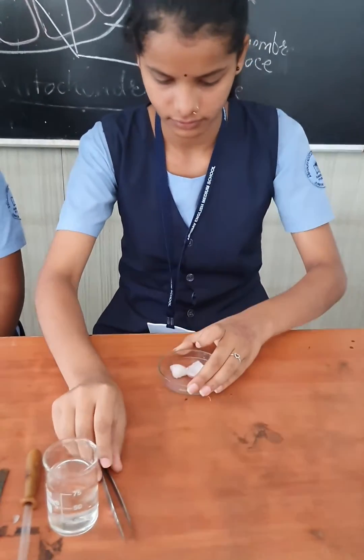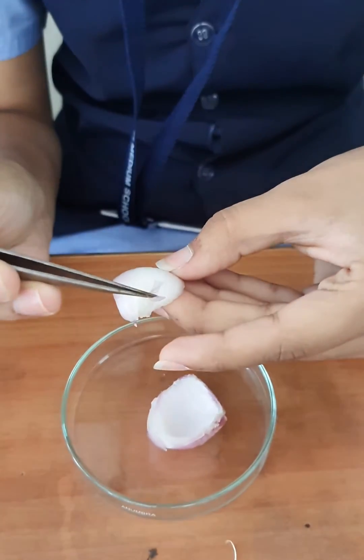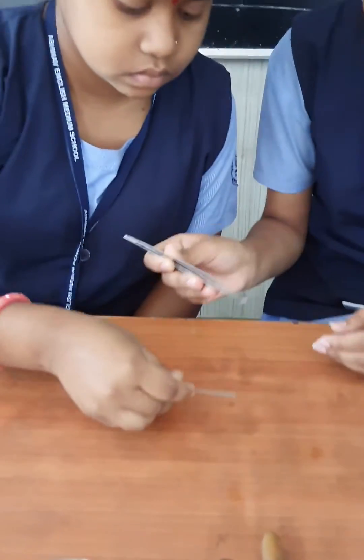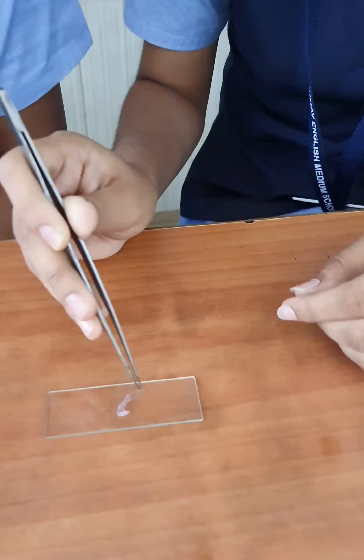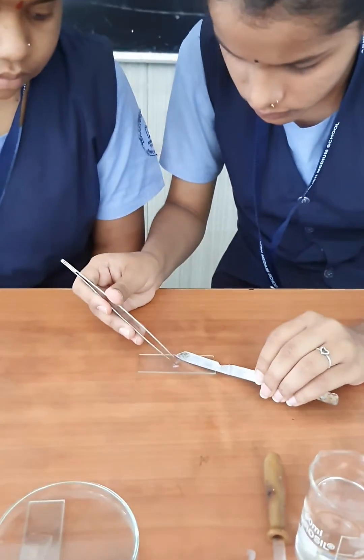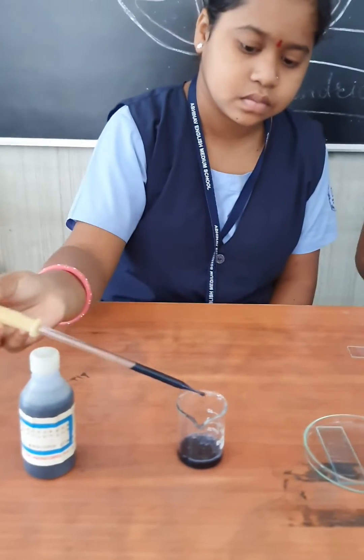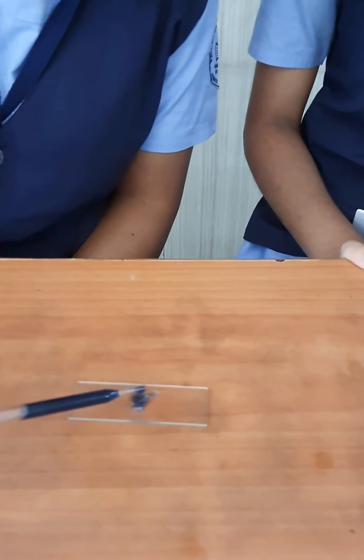First, tear a fresh leaf of onion and collect a piece of the peel. Spread this peel carefully on a slide. Now put a few drops of Janus green B stain on the peel and allow it to stain for 10 minutes.